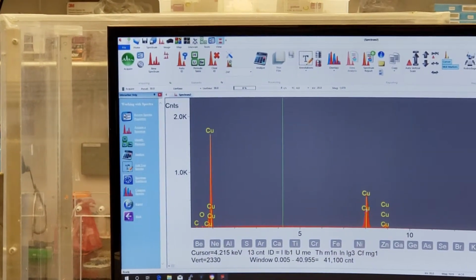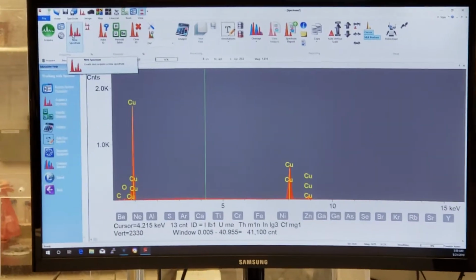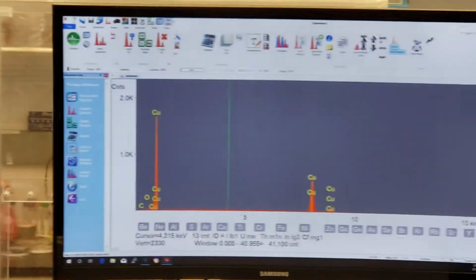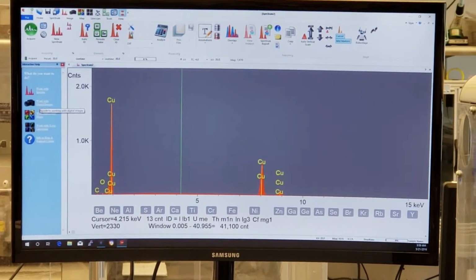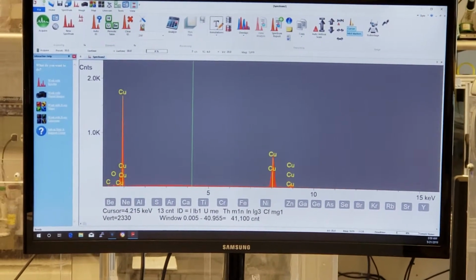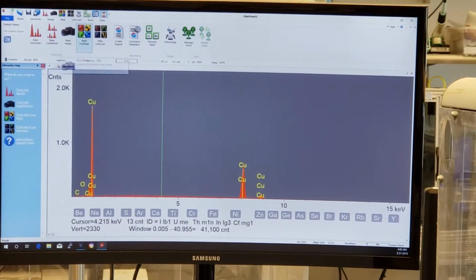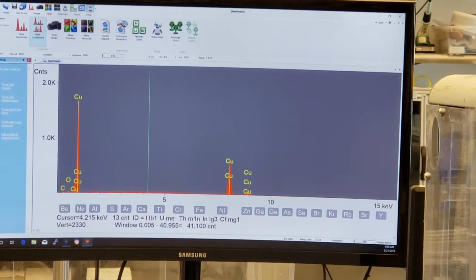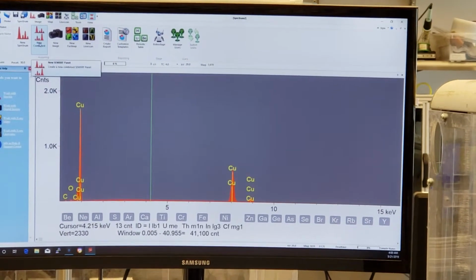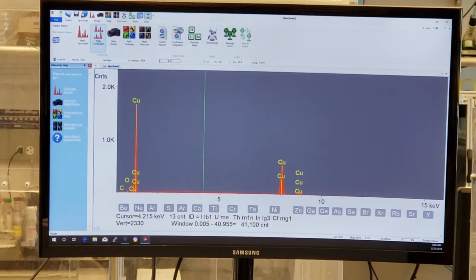All right? So realistically, all we did was acquire a new spectra, and then I went to the flow chart of spectra, because we have 4 features in the software. We've got spectra, images, maps, and line scan. Same thing up here. If I go to home, my home window, spectra, images, maps, line scan. This panel, SEM XRF panel, you don't have an X-ray source, so don't worry about that. It's just part of the string, though, so it reads it.